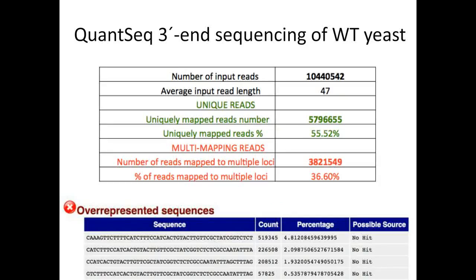And so when we first started to perform 3' end sequencing on wild-type yeast, we were able to get a large number of reads using the QuantSeq platform, and we obtained over 10 million reads for one sample in this case. And we noticed that only roughly half of the reads mapped to unique positions within the genome, and nearly 40% of the reads were mapping to multiple positions. And when we looked at the FastQC report on the overrepresented sequences in this sequencing experiment, we noticed that many of these sequences mapped to the ribosomal RNA.